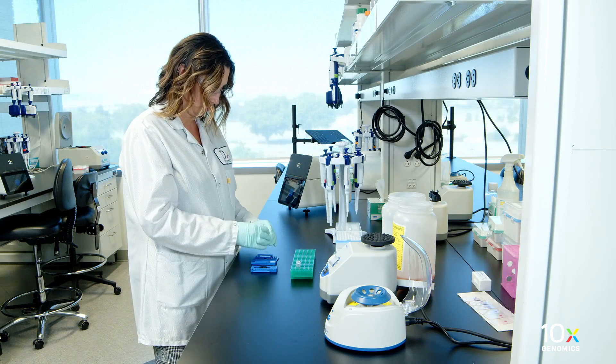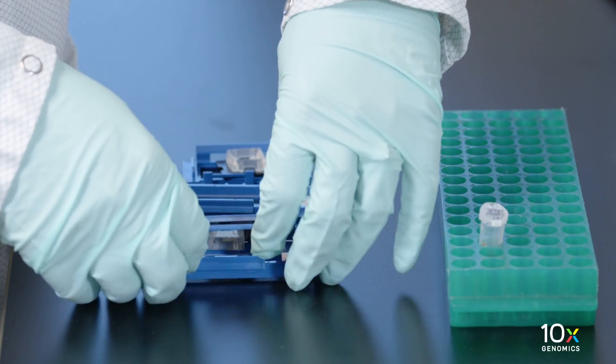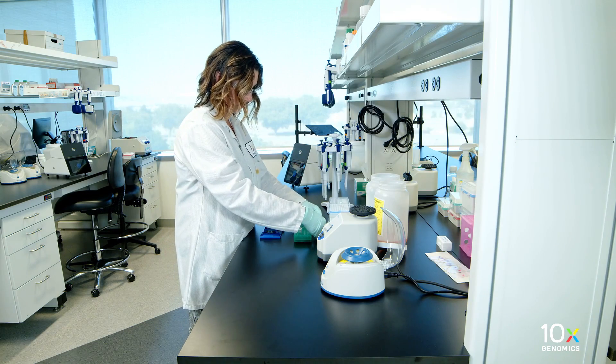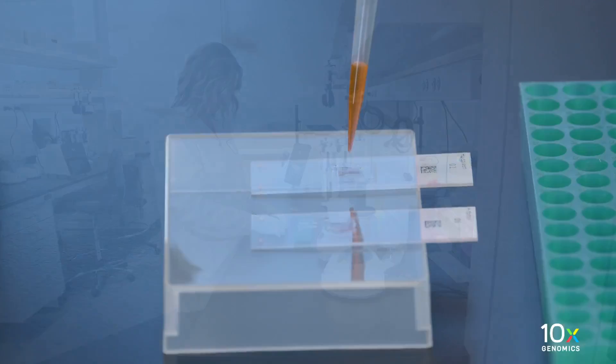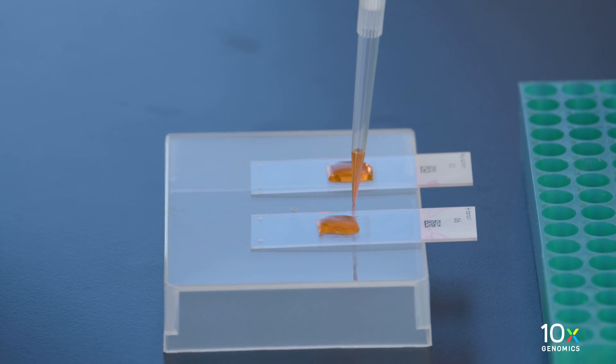Remove the tissue slide from the tissue slide cassette. Add 300 microliters of 10% eosin to uniformly cover each tissue section per slide. Incubate for one minute at room temperature.